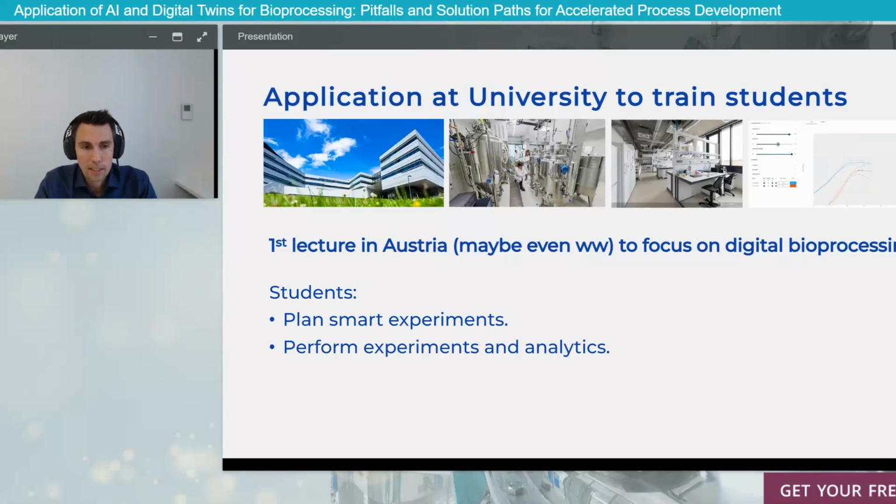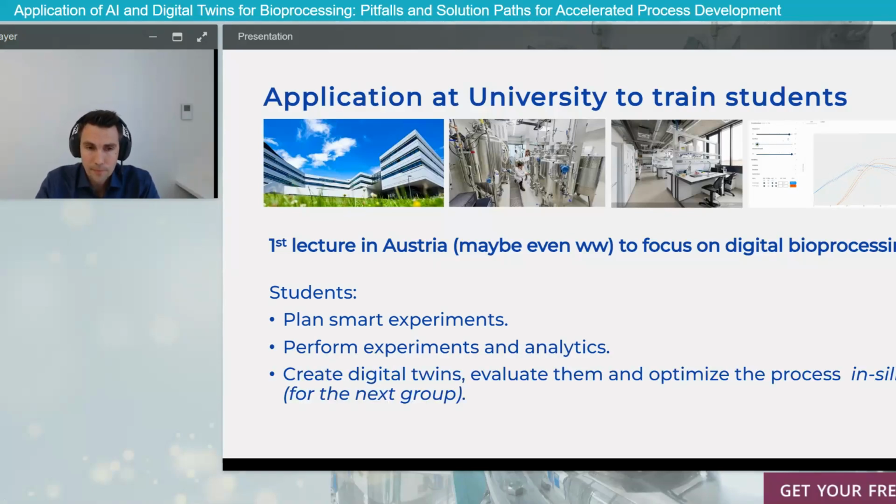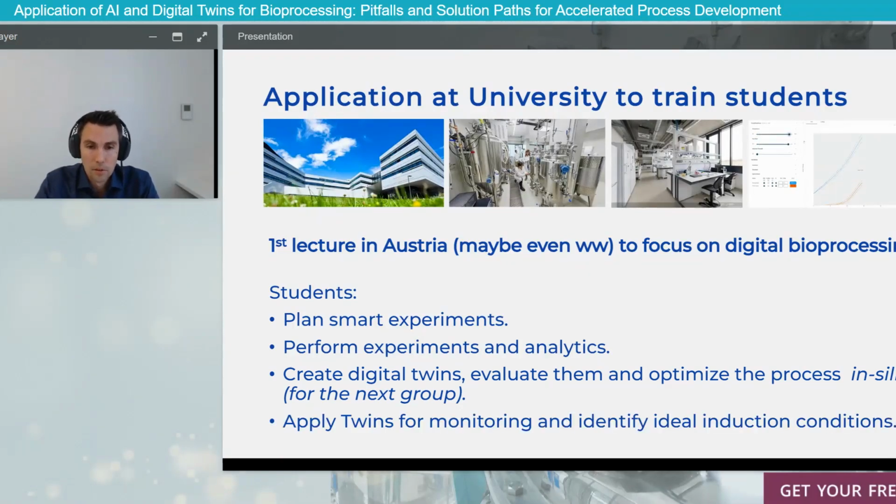So they are planning the experiments, they're executing the experiments, and they are learning how to optimize together, how to find a certain optimum inside your process. So this is very beneficial. When I look back from my side, from how my statistics were at university, I would have loved to have something more tangible for bioprocessing. So that's why we want to also give something back.